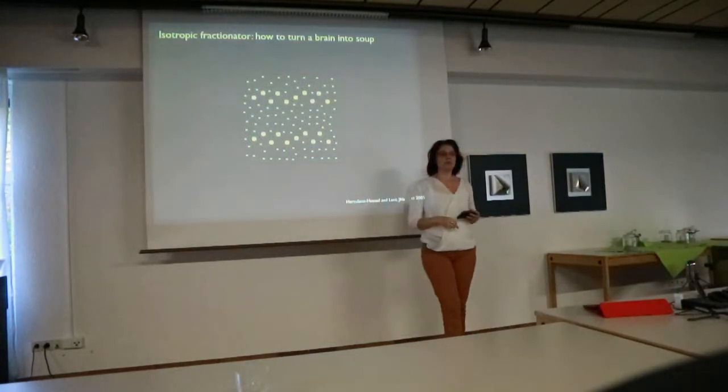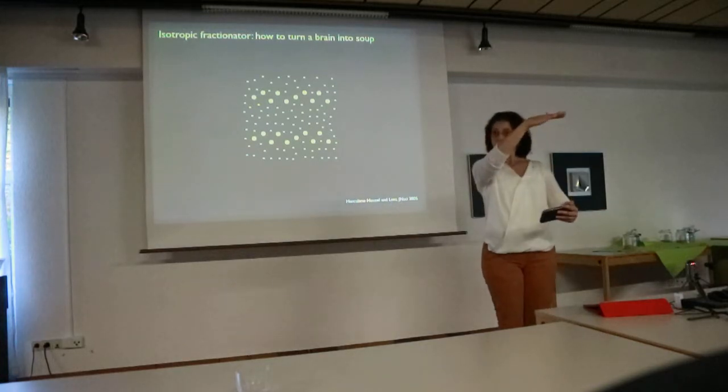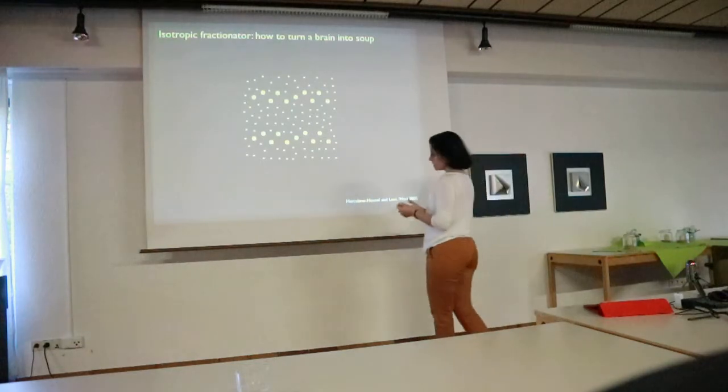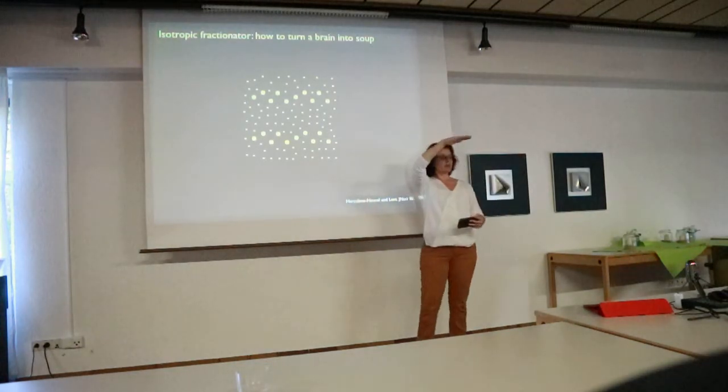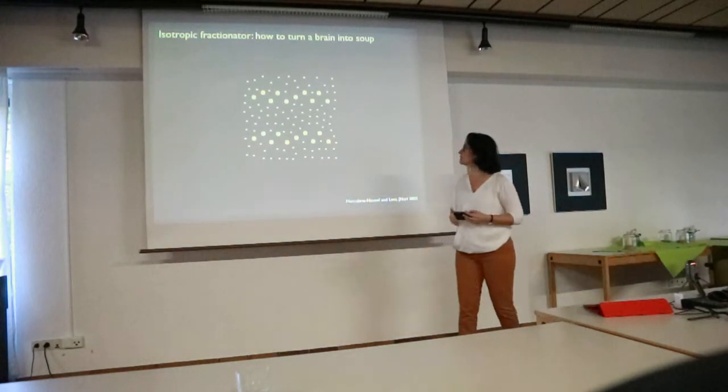but not the nuclear membrane. So you end up with some volume of soup, really, free cell nuclei just sloshing around in that volume, and you choose what that volume is going to be. You can just round it up to a number that you can read on a graduated cylinder.